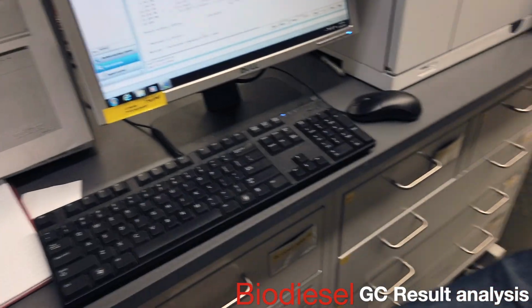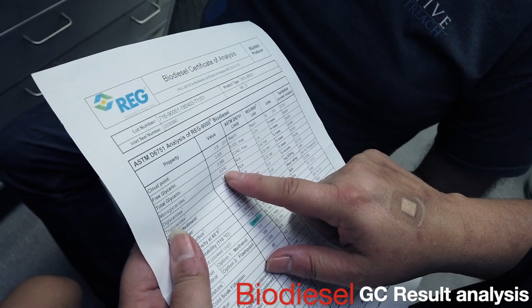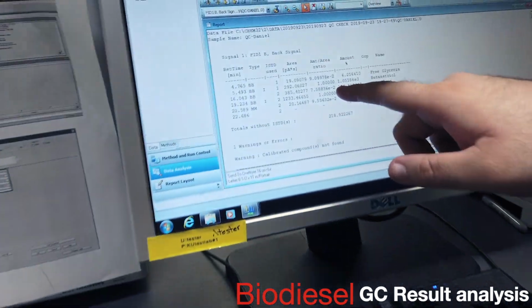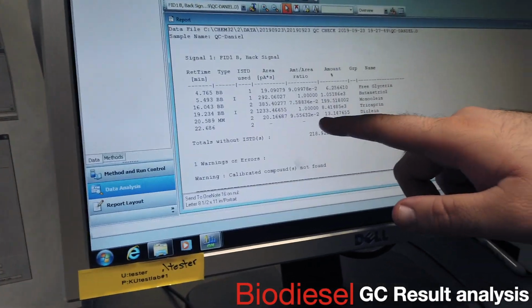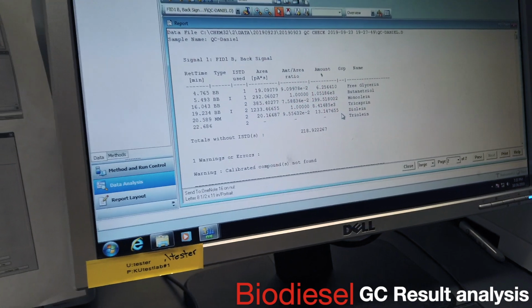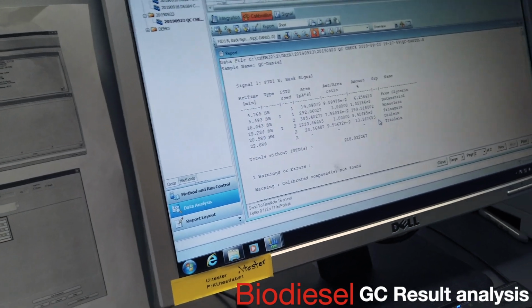So monoglycerides was 0.242. If that's 0.006, that's basically 0.2. And then diglycerides is 0.01, so over 0.013. And then triglycerides is 0. Right, we didn't see anything. That's working, it's awesome. It's just the units are off, which I just gotta fix.